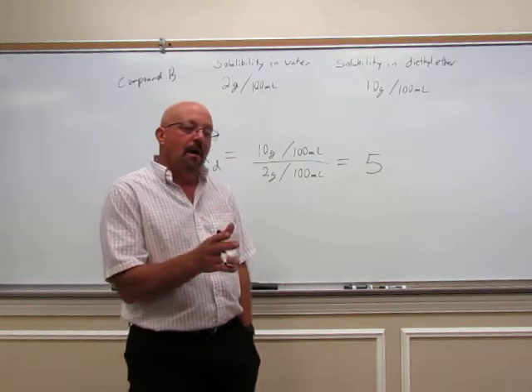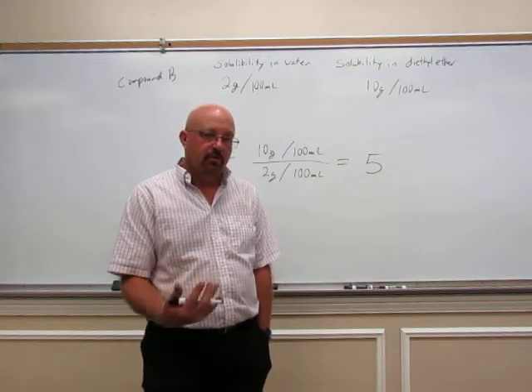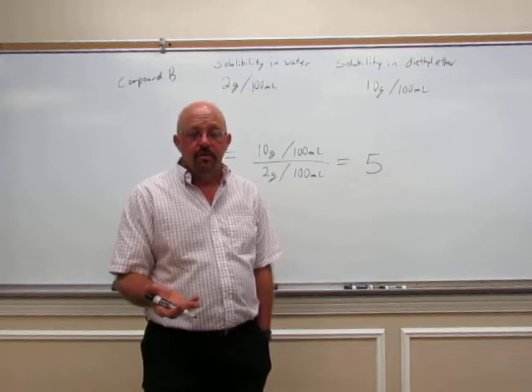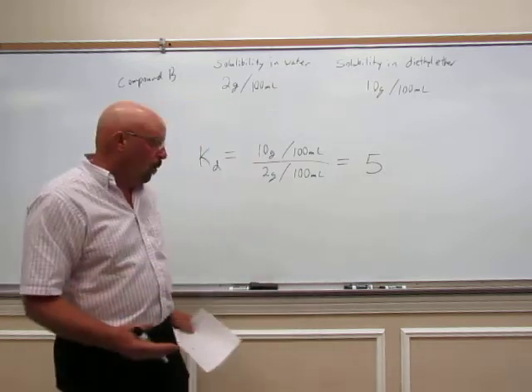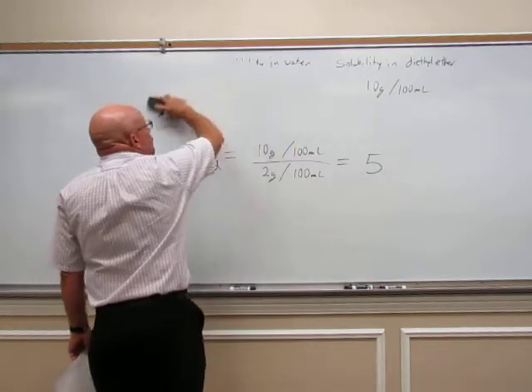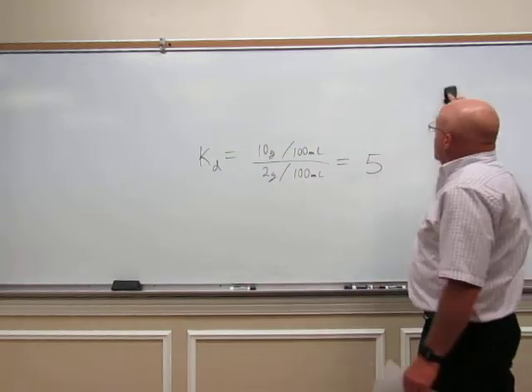But if we were trying to isolate as much compound as possible out of the mixture, we would want to do multiple extractions. It's much better to do several small ones than it is to do one large one. Now, I'm going to go through some calculations to prove that to you. And this will also help you with post-lab questions.